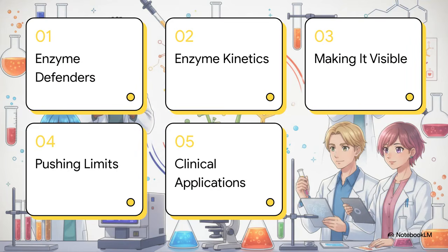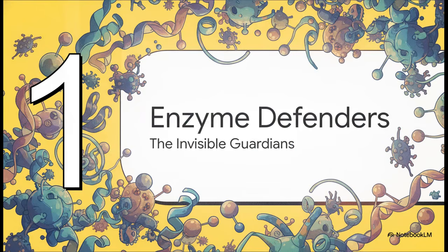Well, here's our roadmap for the explainer to figure that out. We'll start with the invisible enzyme defenders, move on to the mechanics of enzyme kinetics, figure out how to make the invisible visible, push the limits of these reactions, and finally wrap up with real-world clinical applications. Starting right off with Section 1, the invisible enzyme defenders.